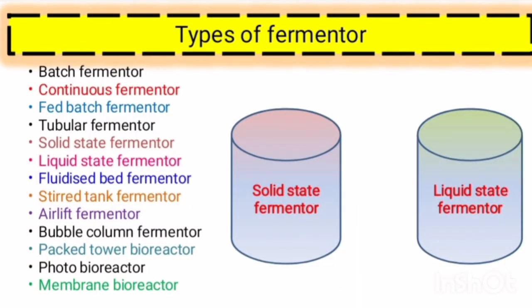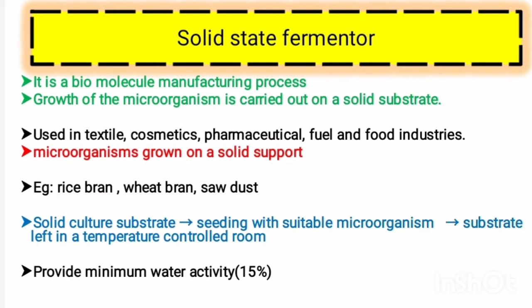Types of fermenters. There are different types of fermenters that are listed here. In this list, the first three fermenters were discussed earlier. Now we can discuss solid state fermenter and liquid state fermenter. First one, solid state fermenter.